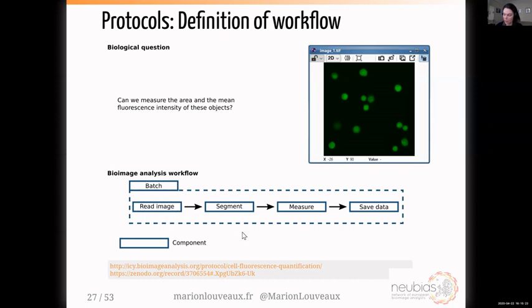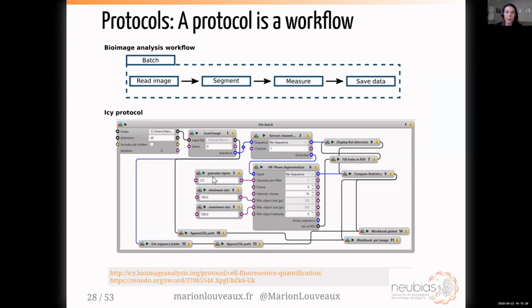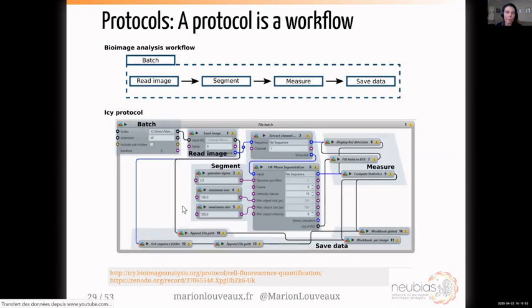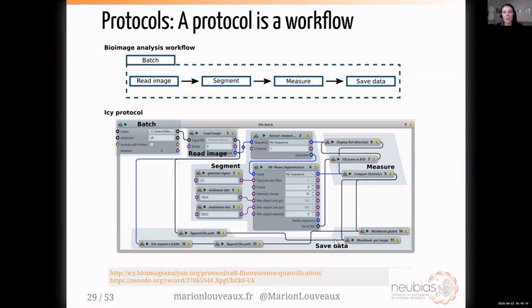The first step in bio image analysis is to design a workflow. Here the workflow is: read the image, segment the objects, measure their area and fluorescence intensity, save the data, and loop over several images for batch processing. A bio image analysis workflow is the succession of these different steps, and each step corresponds to a component. An engineer from the image analysis hub designed a protocol in ICY — we'll use this protocol for the rest of the second part, and I'll go into the different parts, explaining how to make one similar to this.